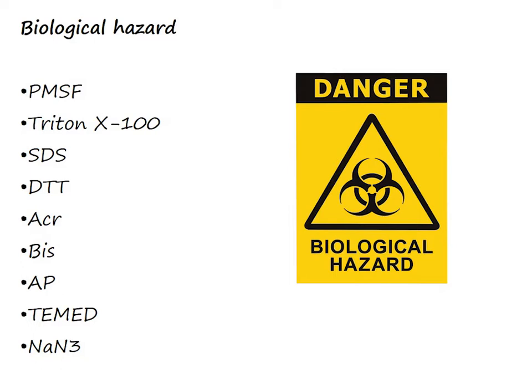Acrylamide, APS, and TEMED are used in preparing the gel. And sodium azide, we use it to inhibit bacteria, or we use it to prepare the stripping buffer. They're all toxic, so be careful and protect yourselves.